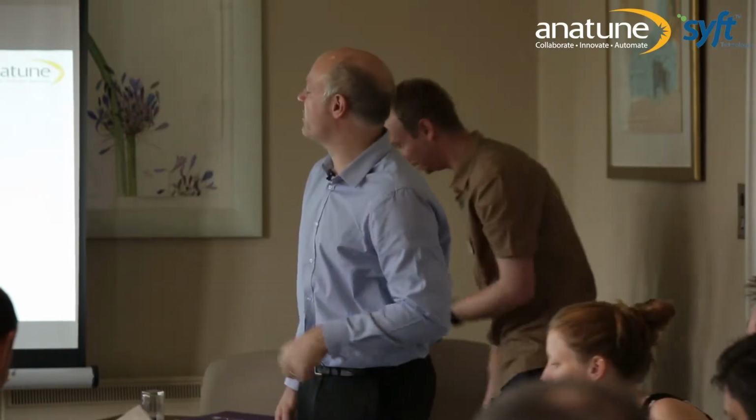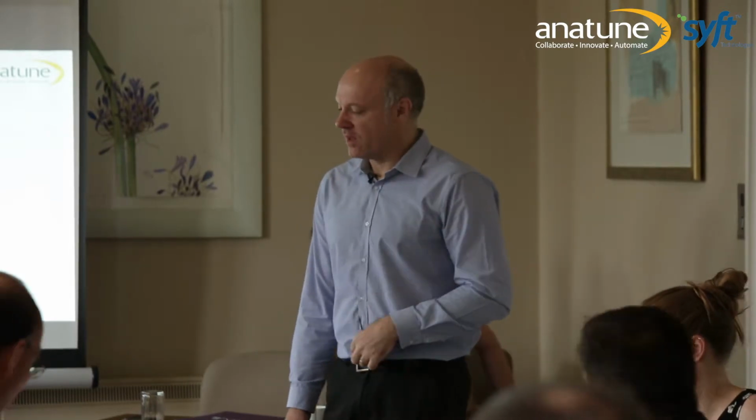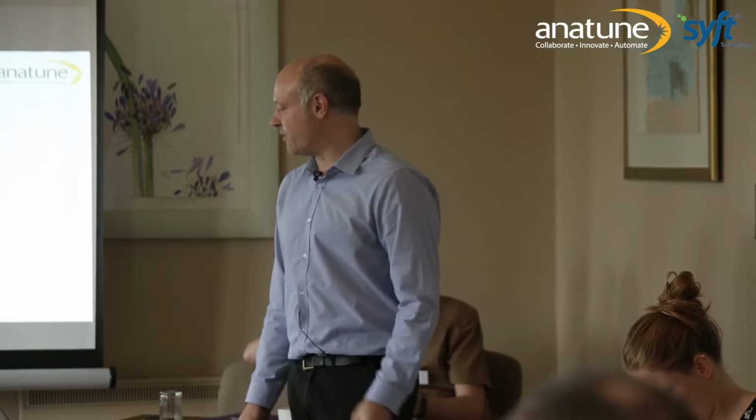Yeah. So this follows on a bit, I suppose, from yesterday's talk about automation, but it's about creating methods that are validatable on SIFT-MS, because I have been asked a number of times, is it possible to validate SIFT-MS methods? It's quite an unusual technique compared to traditional analysis techniques. So can we validate SIFT-MS methods?